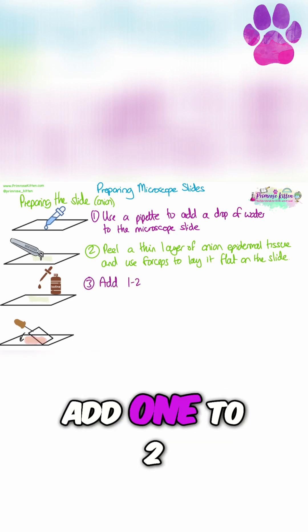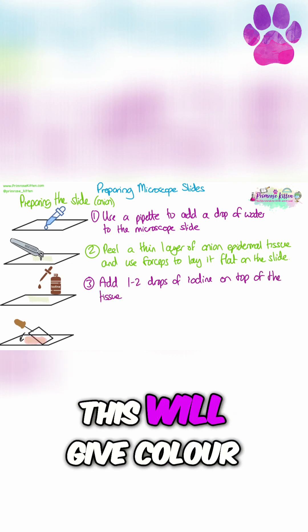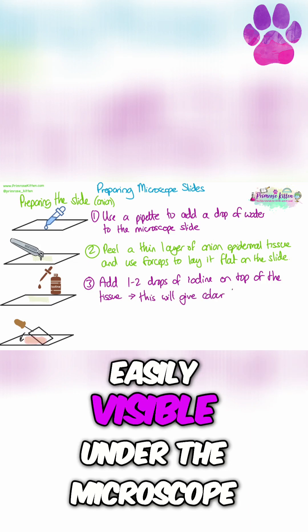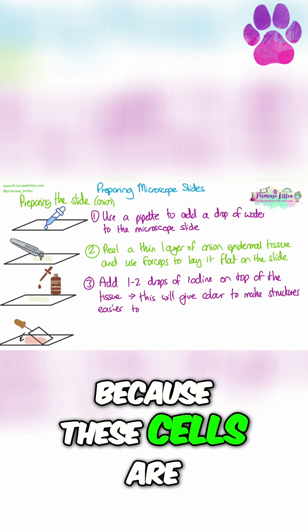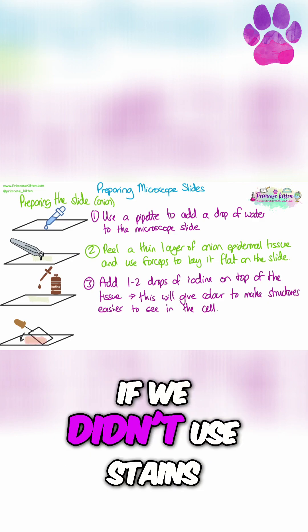Then you're going to add one to two drops of iodine on top of the tissue. This will give colour to the cells, and it will stain structures to make them more easily visible under the microscope, because these cells are completely transparent, so we won't be able to see anything if we didn't use stains.